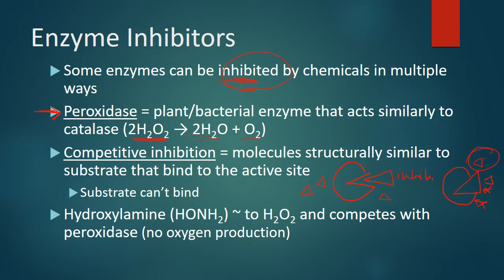Hydroxylamine, HONH2, is similar to H2O2 in shape, so kind of like this giant piece of pie, and competes with peroxidase. So that means it won't produce any oxygen.